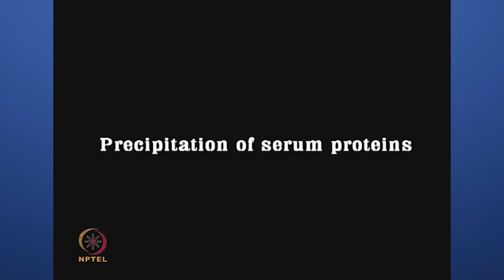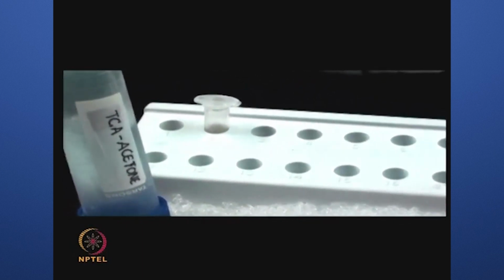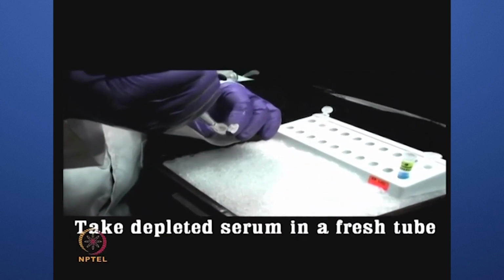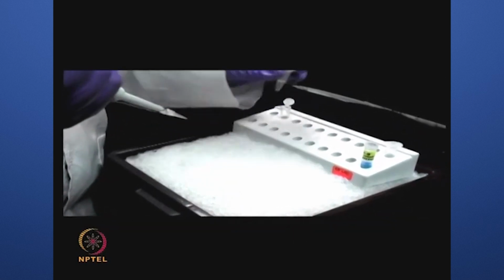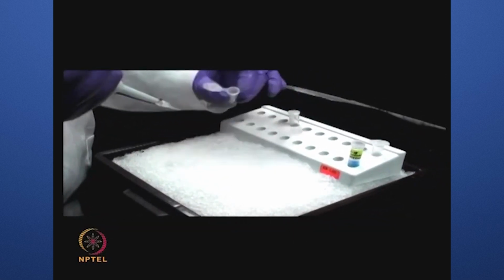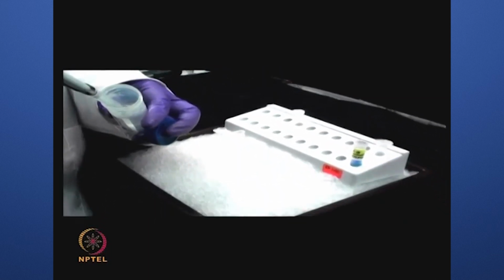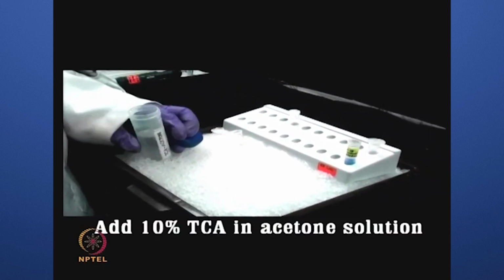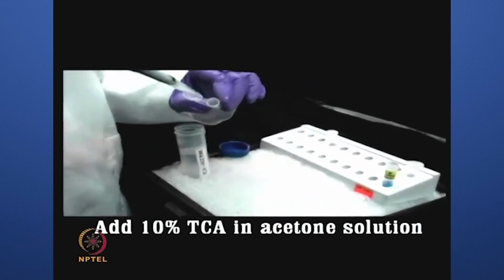Protein precipitation. Transfer the serum depleted of high abundance proteins into a fresh tube. To this, add a mixture of trichloroacetic acid and acetone and mix the contents well.